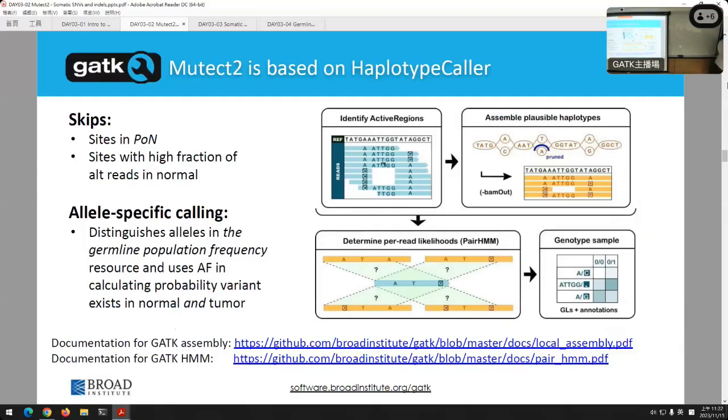I see. So at this point, you're mentioning different allelic frequencies due to expression because they might have a change in promoter. I believe here we're talking about different allelic frequencies present just in the actual DNA here. That's how it's expressed and shows up in the RNA. Yes, okay. But you mentioned a promoter might change, for instance, and you might have a higher expression there at the level of what's being expressed versus it simply being different in the germline.